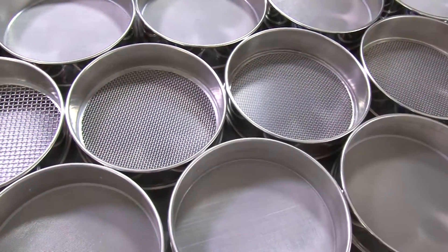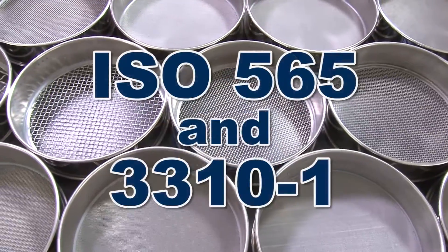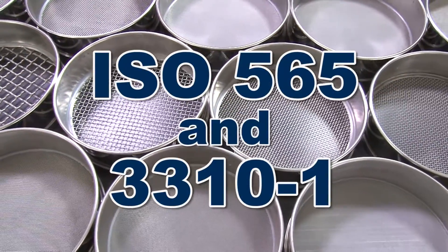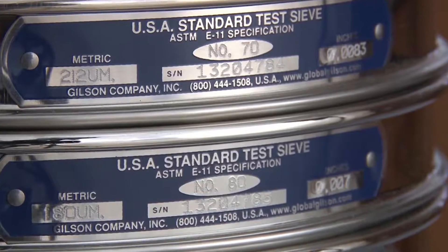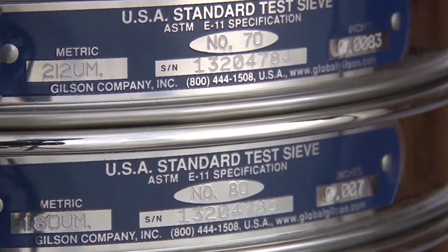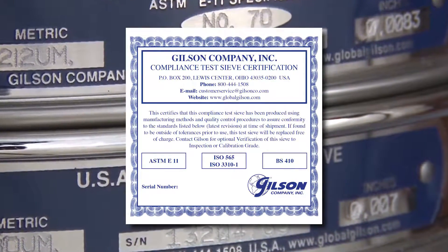Gilson sieves meet either ASTM E11 requirements or ISO 565 and 3310-1 specifications. Each Gilson sieve is serial numbered and comes with a manufacturer's certificate of compliance to the appropriate standard.